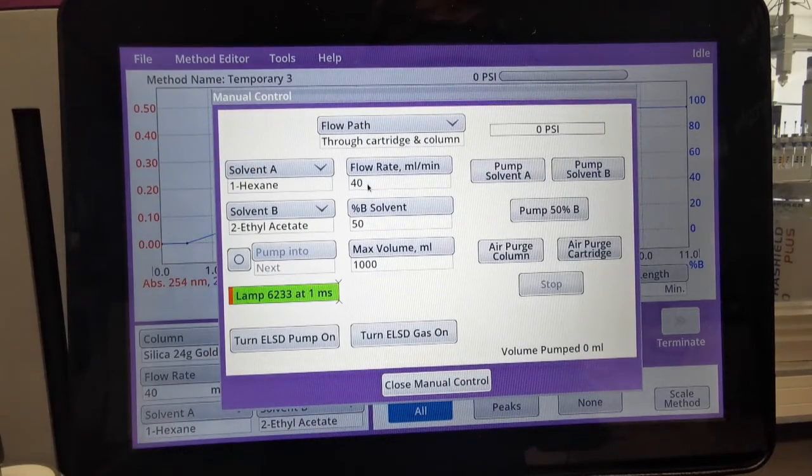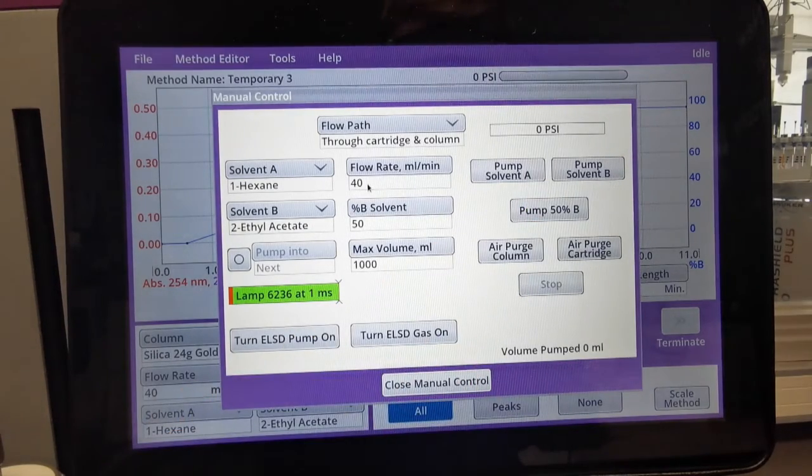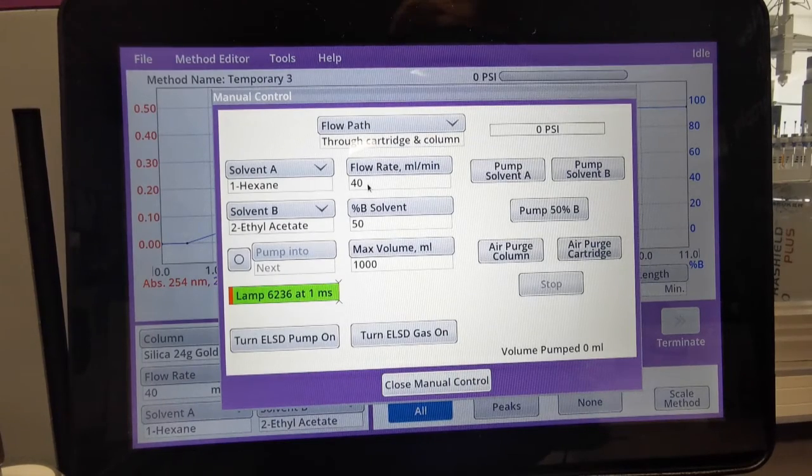As long as an IPA bottle is placed into solvent line 1 and 2, this is fine. We then press pump 50% B and it will push solvent through the system directly into the waste. Once this has been completed, the system has been fully primed with IPA and we're then ready to reprime with water and the C2 Nitrile. This would be the same process for if you were wanting to switch back between reverse phase to normal phase.